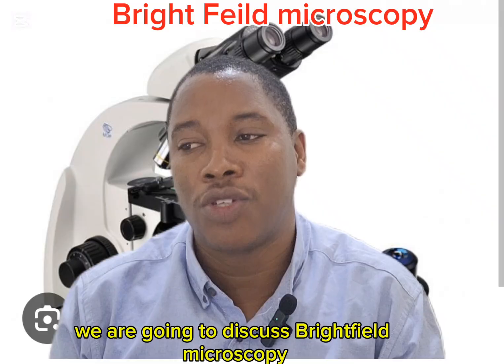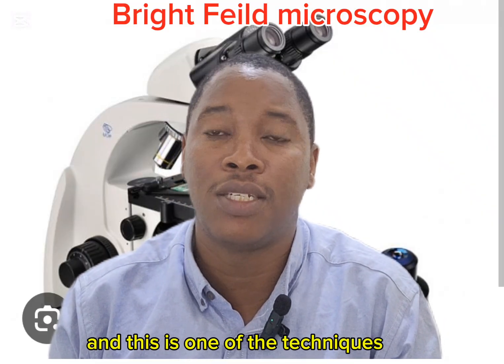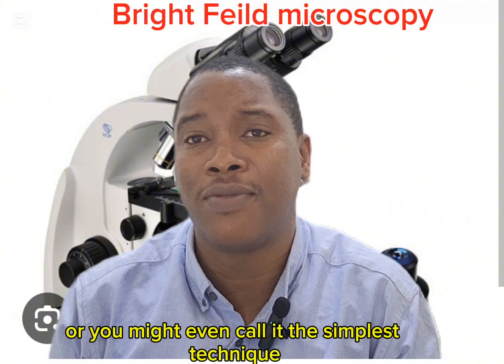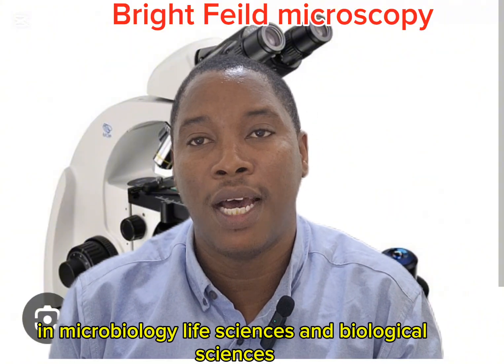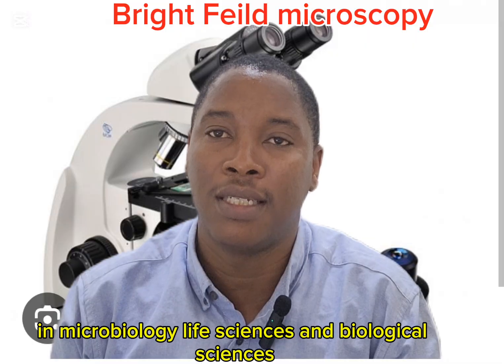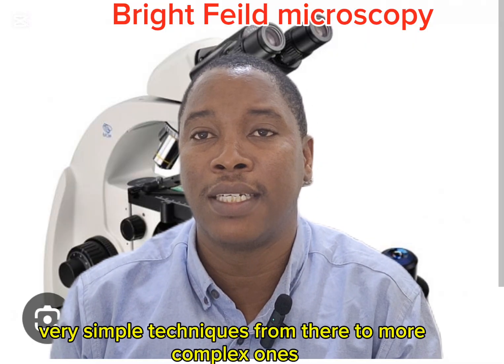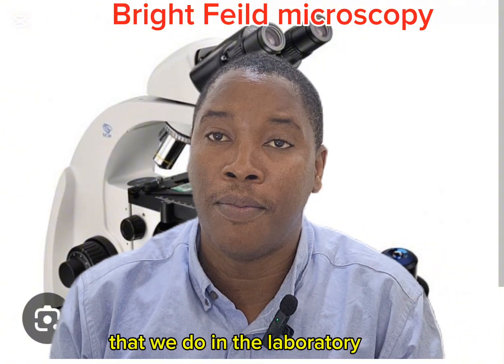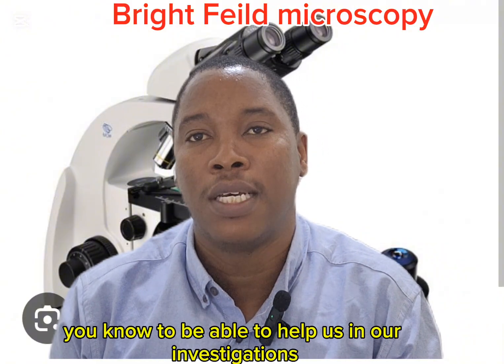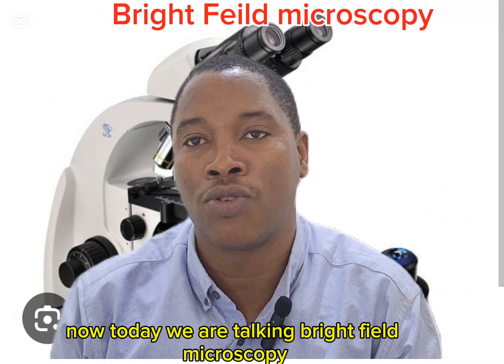And today we're going to discuss bright field microscopy. Bright field microscopy is one of the techniques, or you might even call it the simplest technique, in microbiology, life sciences and biological sciences. I want to take us through a series of very simple techniques, from there to more complex ones that we do in the laboratory, to help us in our investigation. Now, today we're talking bright field microscopy.